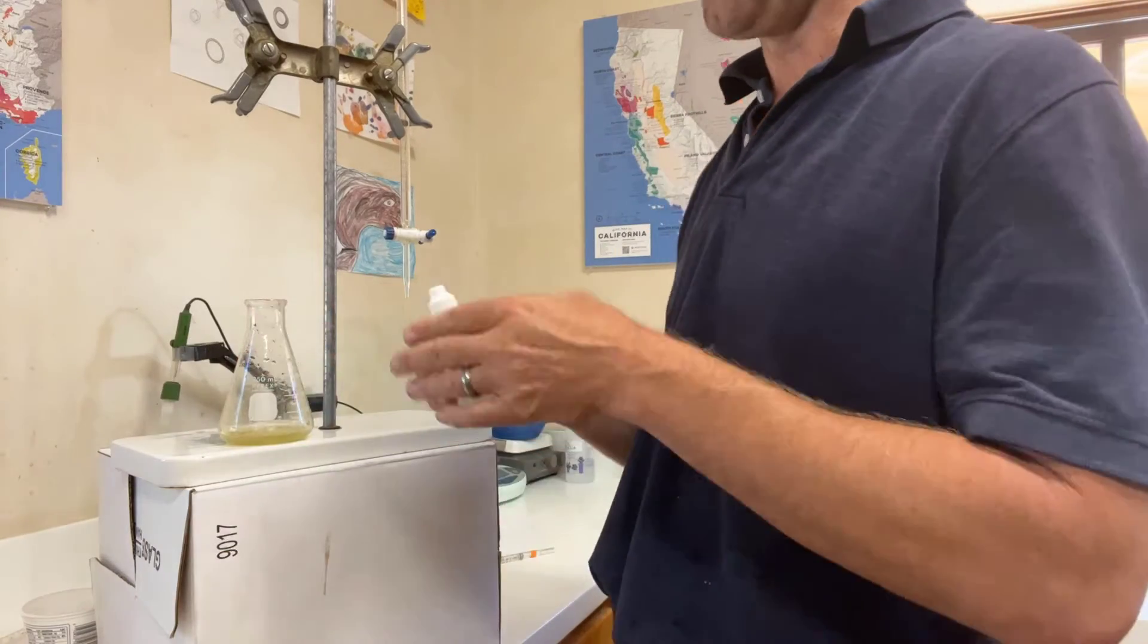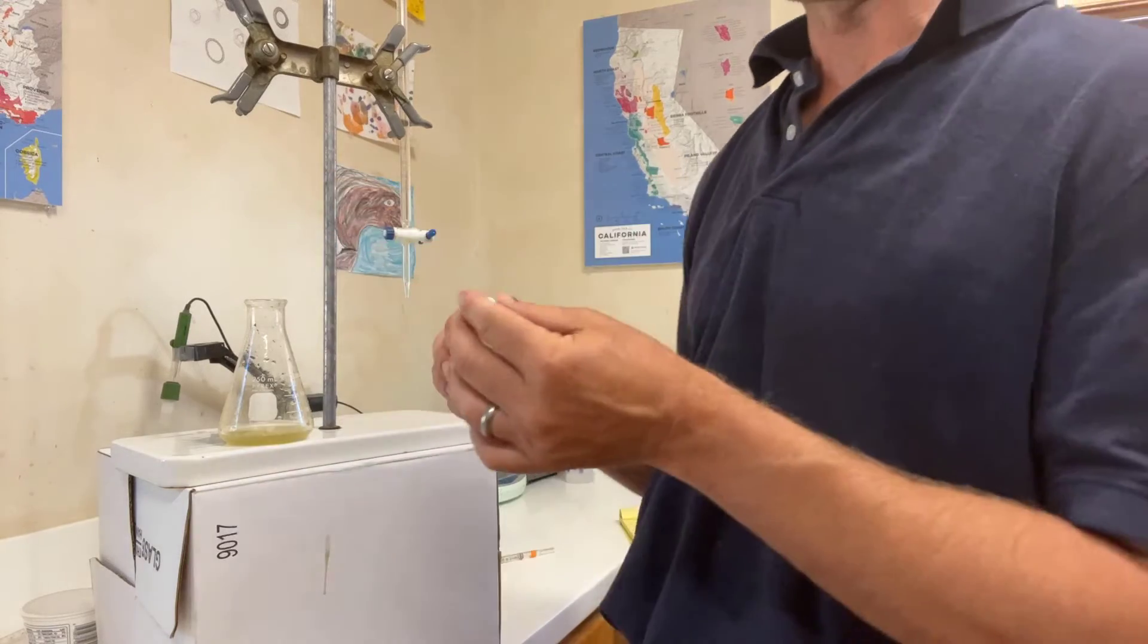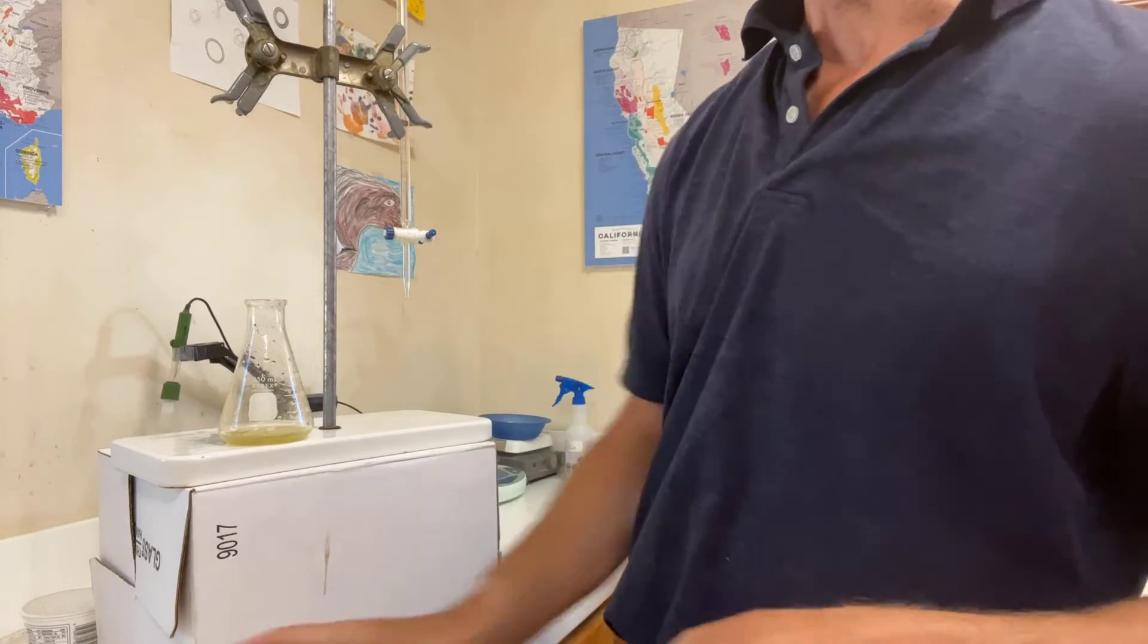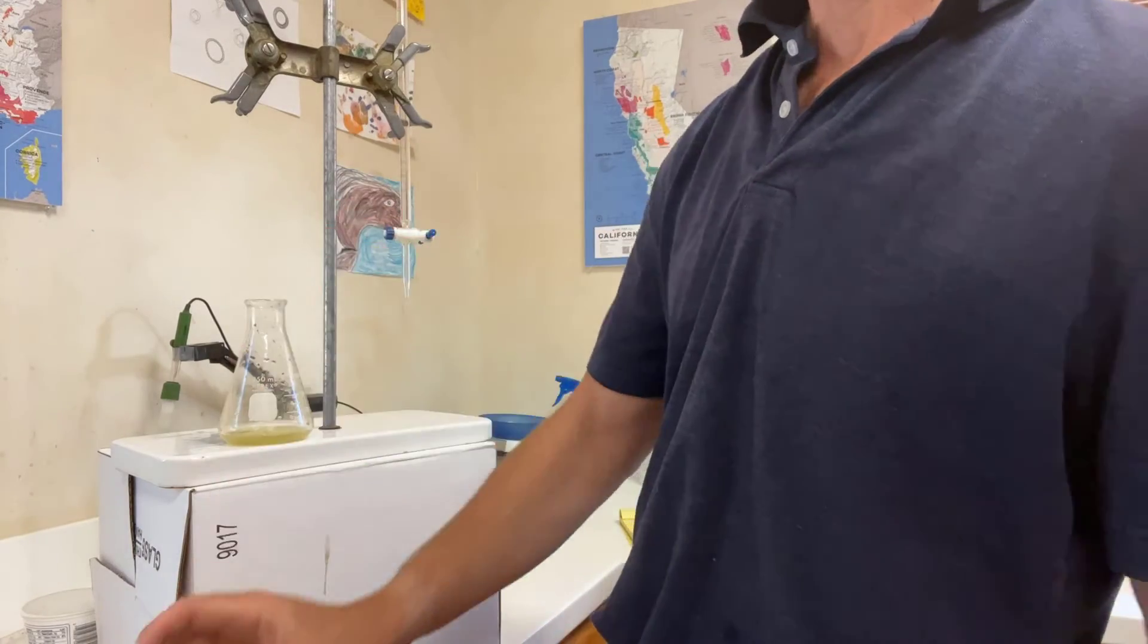A couple drops of this phenolphthalein indicator. It's going to turn pink when the pH gets to 8.2. That's the endpoint. I know from prior measurements this juice is starting at a pH of about 2.9, quite unripe.